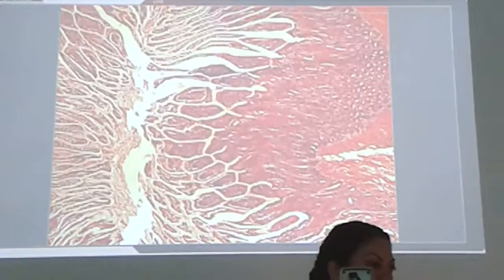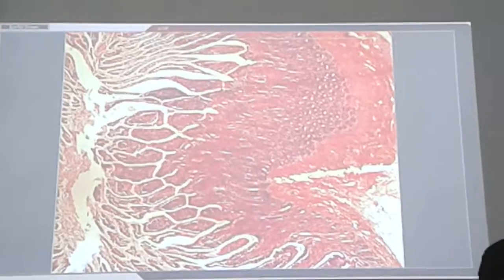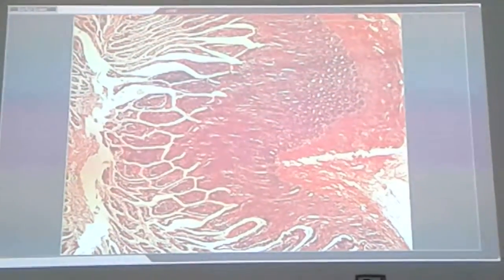Okay, ileum. So, what's the distinguished feature of ileum?